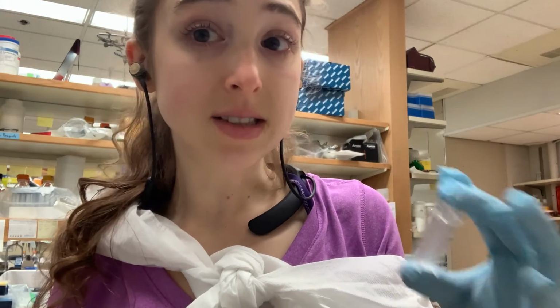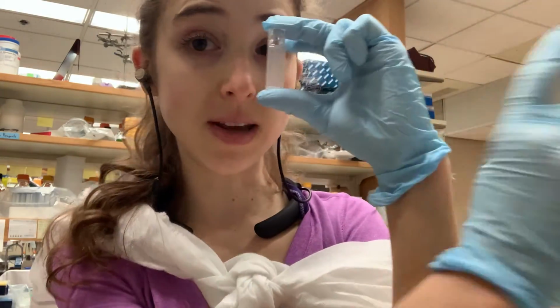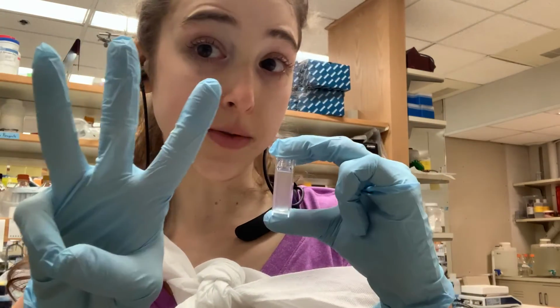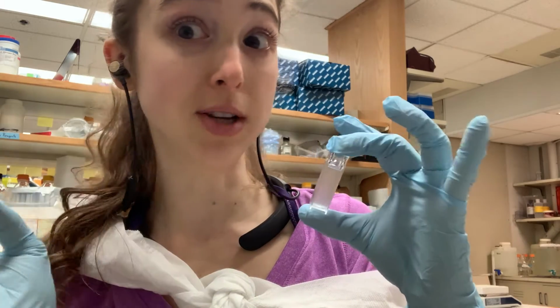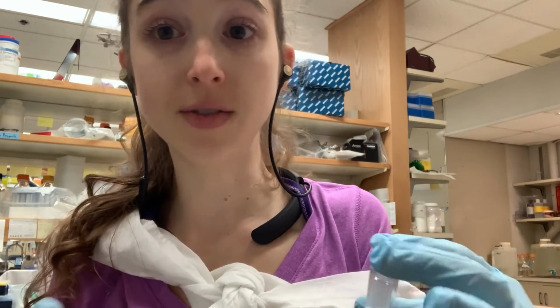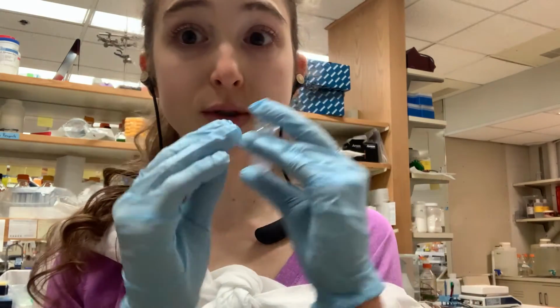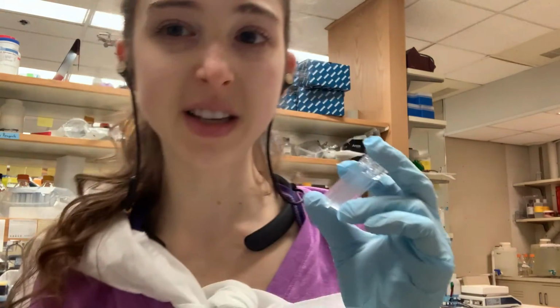So Beer's law tells us that the absorbance, so how much of the light is going to get stolen as it's making its way through the cuvette or through that column of the nanodrop, is going to depend on three things. It's going to depend on that extinction coefficient, which we talked about and we'll talk much more about, which is an intrinsic property of the molecule. And so different molecules will have different extinction coefficients representing how well that molecule will absorb at that wavelength. And that's represented with this little curly E thing.